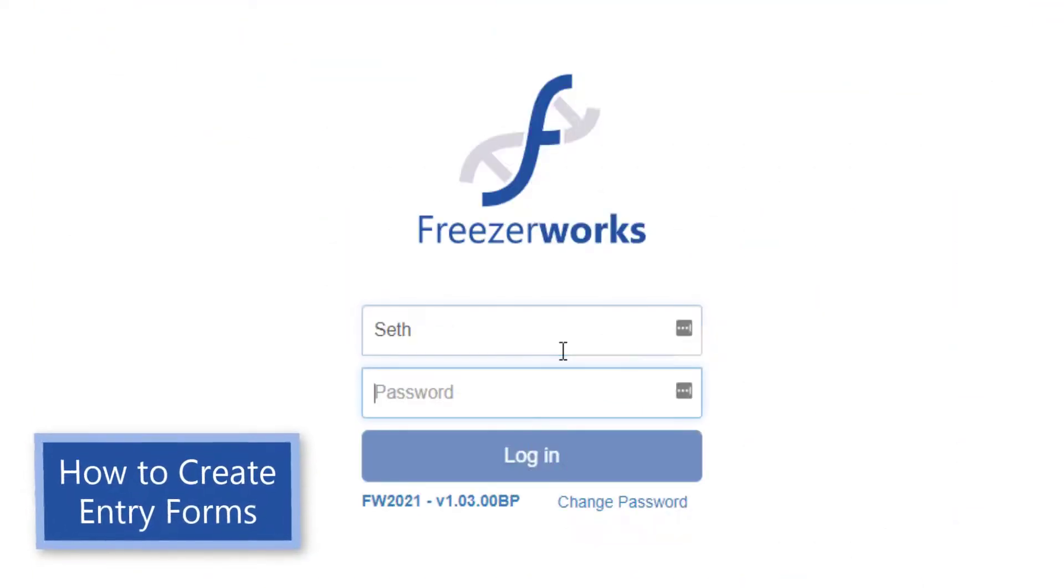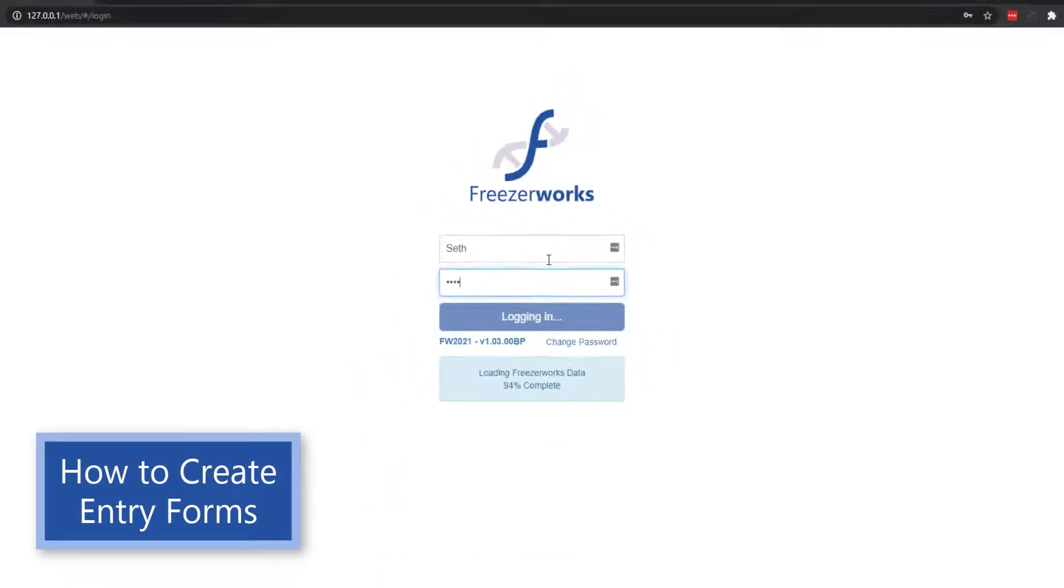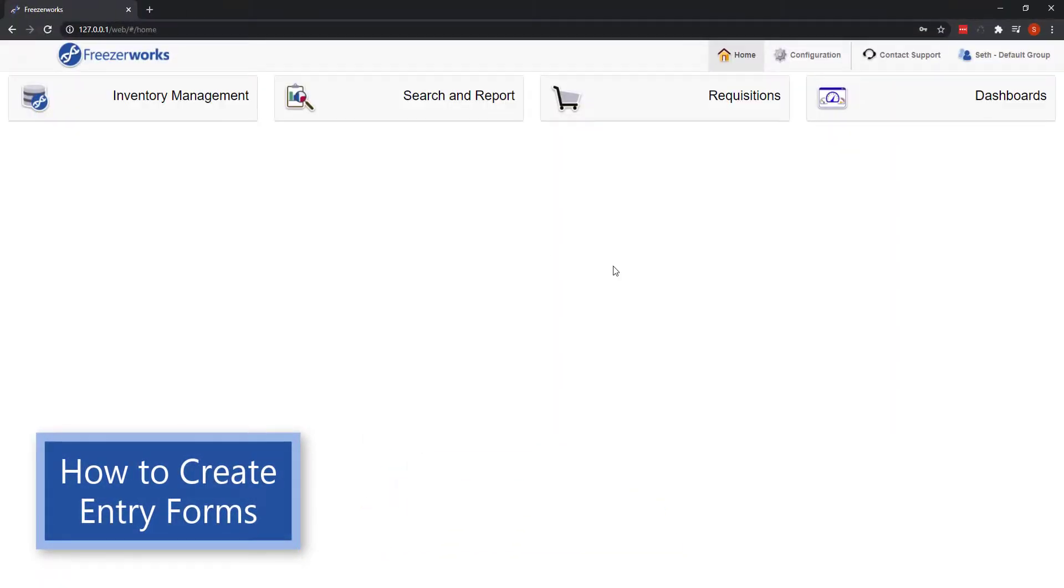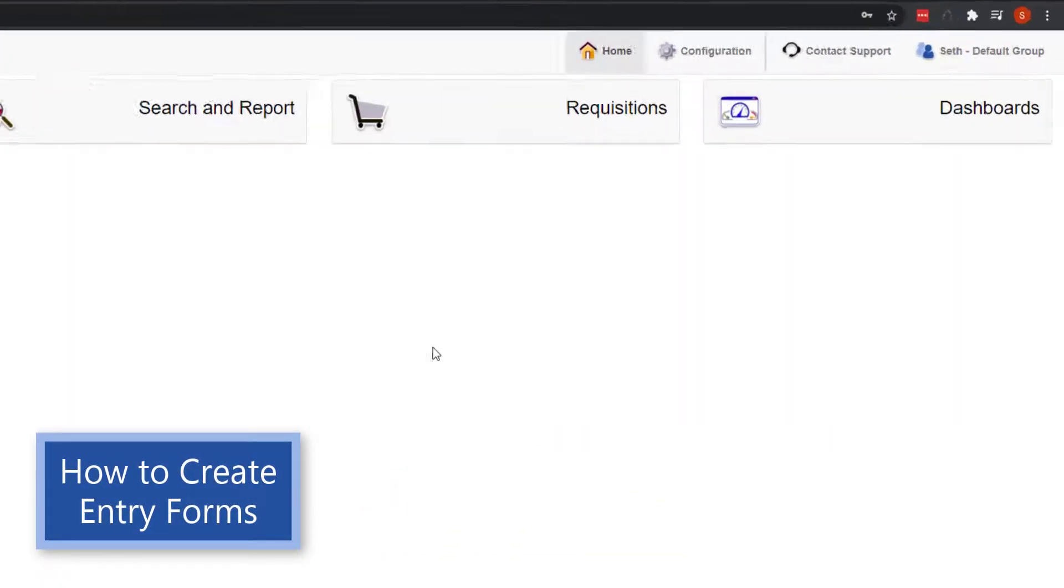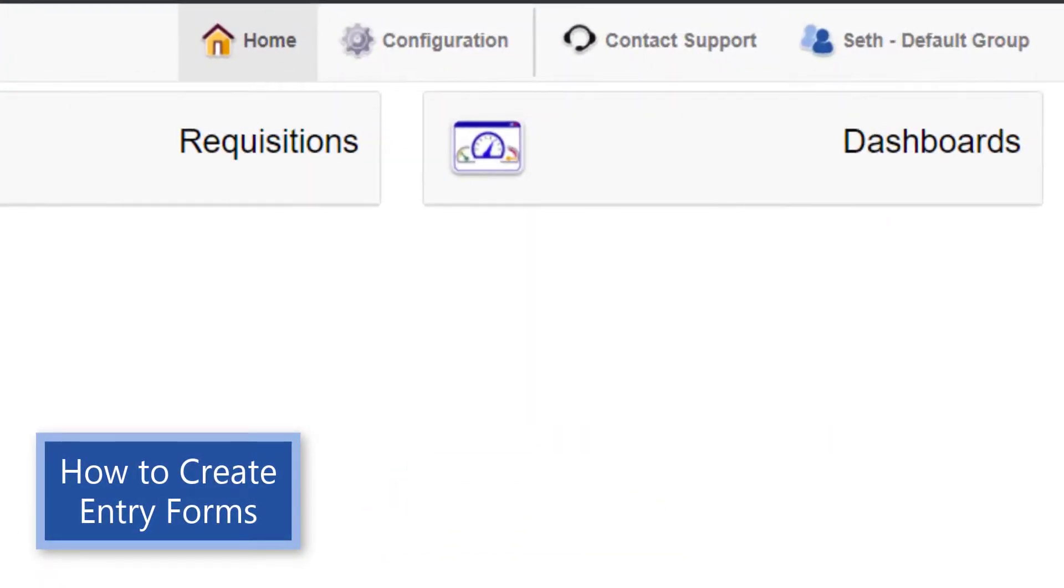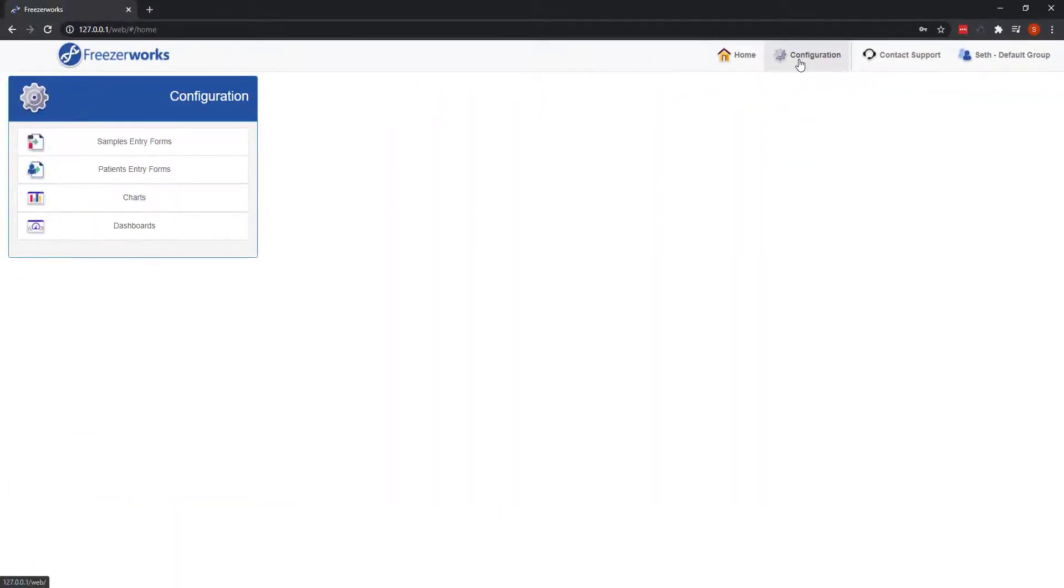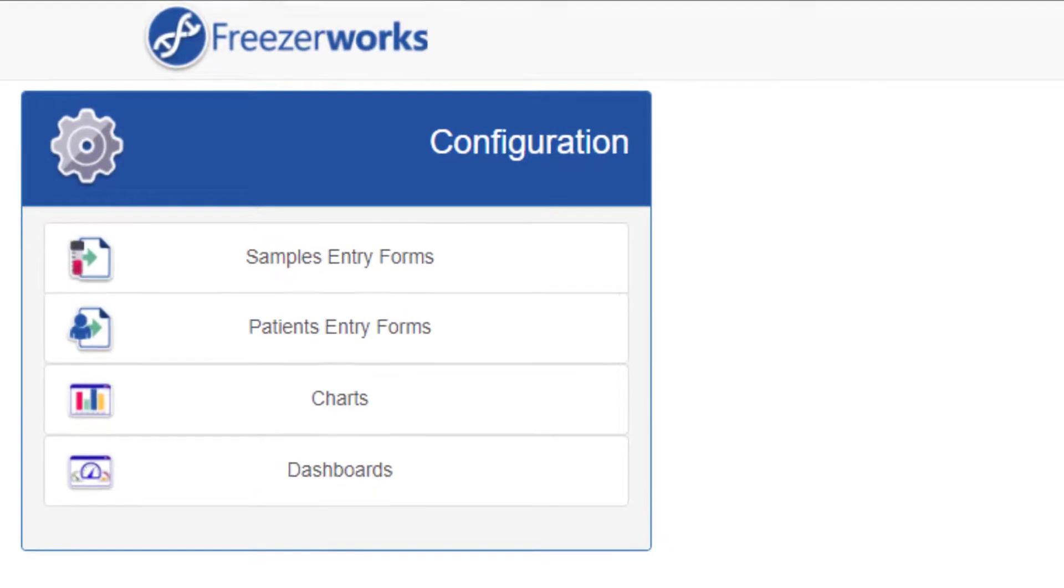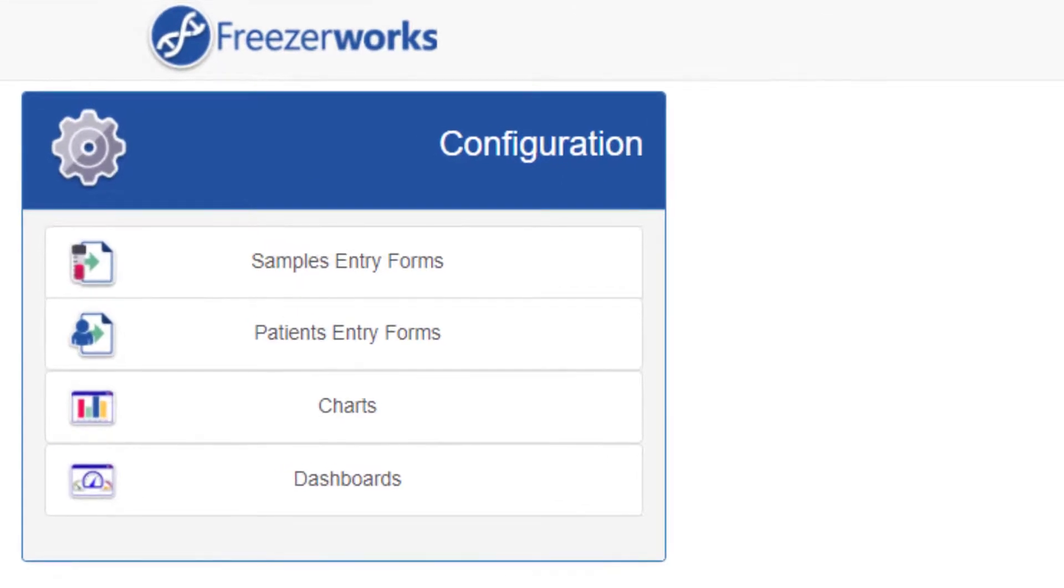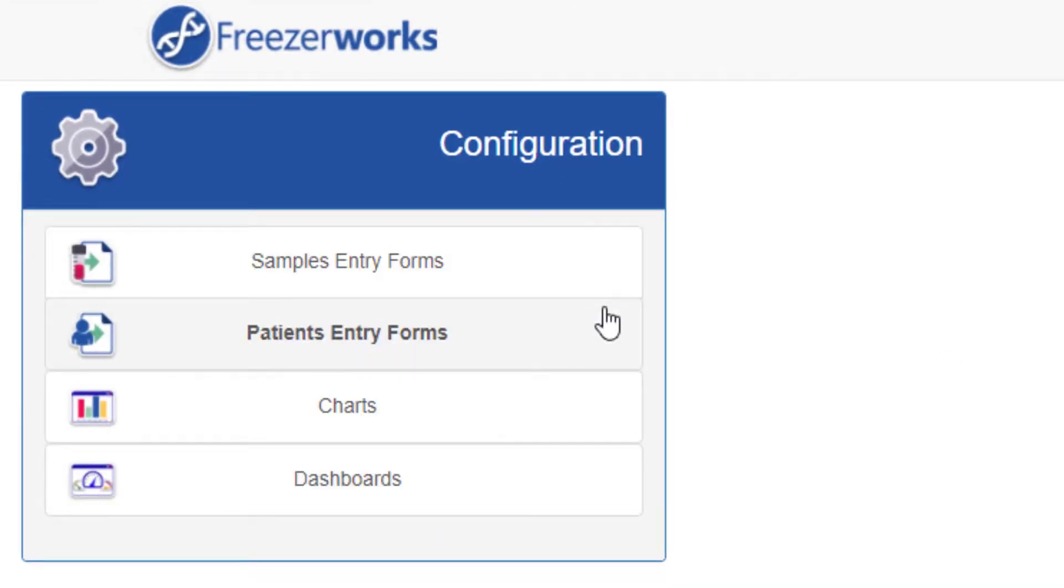Well, to begin, after logging into the web client, turn your attention to the top of the page and click the button entitled configuration. This takes you to the configuration page, which is where you will also go to create charts and dashboards, as well as patient entry forms if you are in Summit or Pinnacle. But we're talking about samples entry forms, so let's click that button.